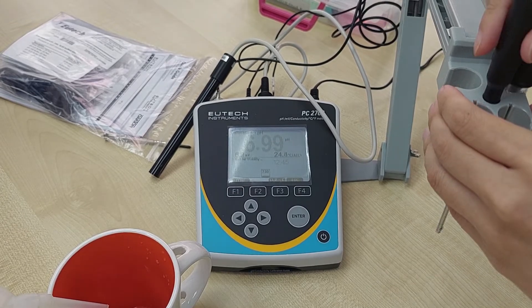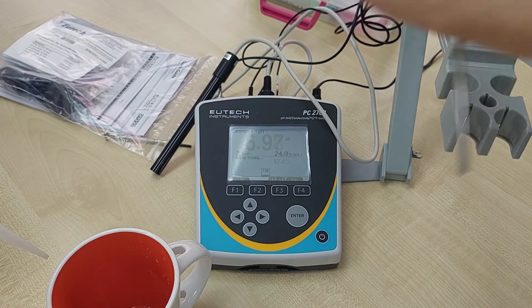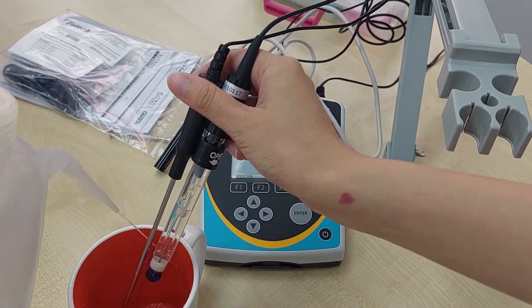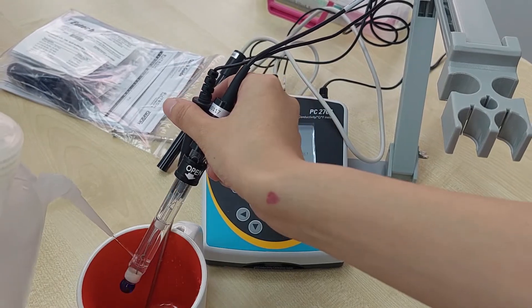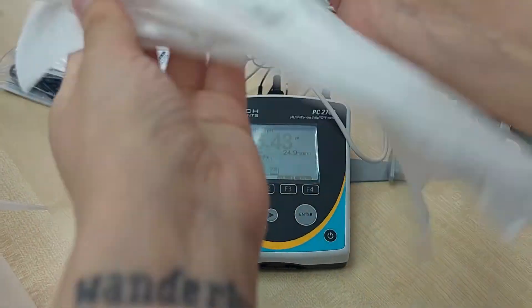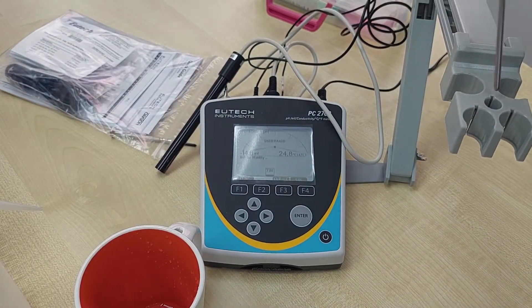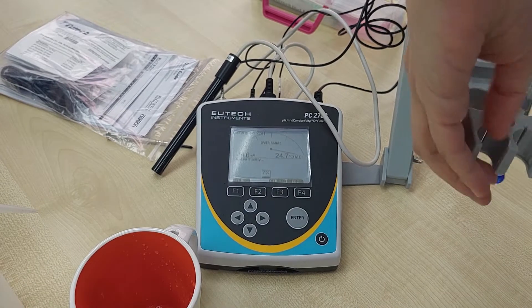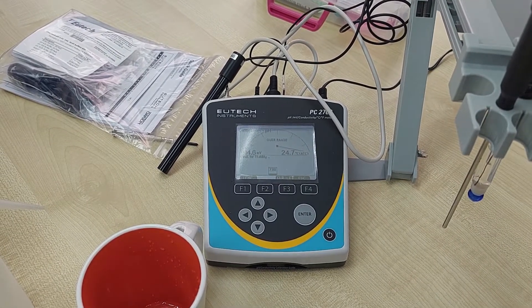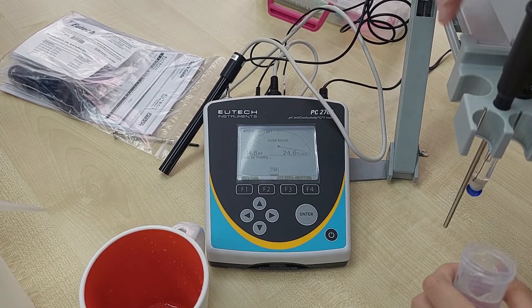After pH 7, you can proceed with pH 4 or pH 10 — it's your choice. We need to rinse the electrode again, then tap it dry. Then dip into the pH 4 buffer and press Enter once stable.